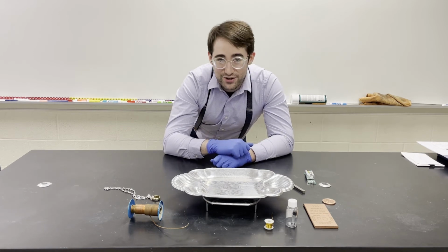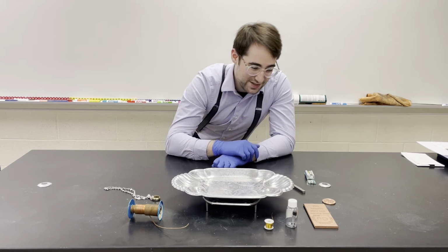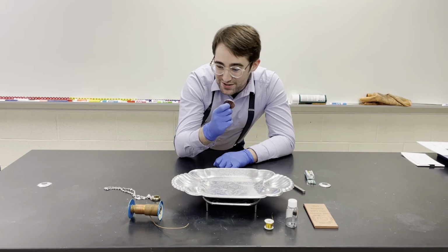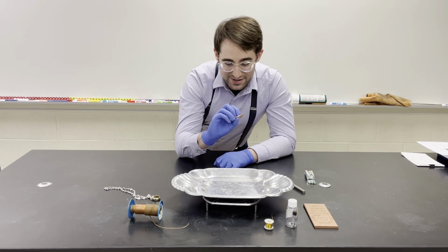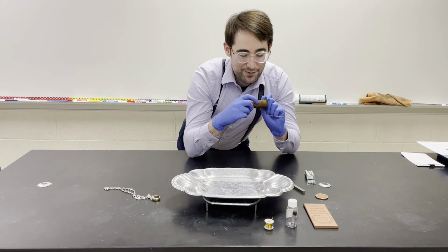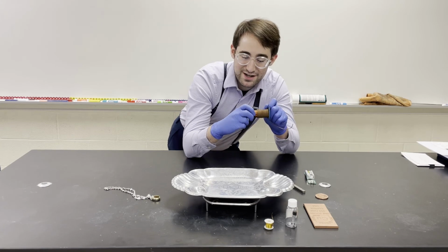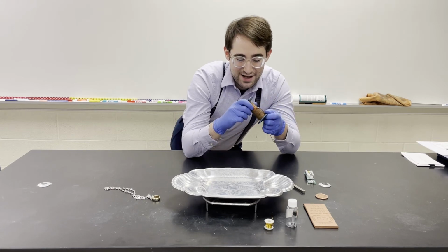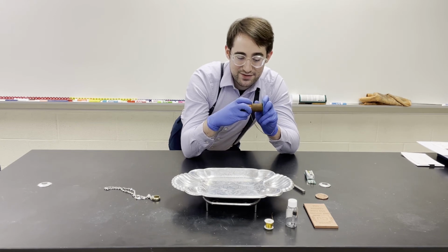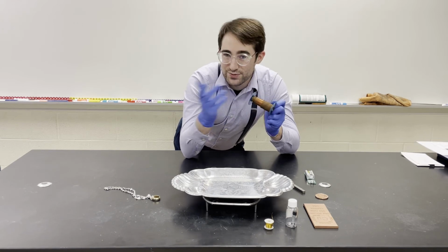All right. You can also look for oxidation, which kind of goes against the shininess of something. So when something looks shiny but has kind of a dullness to its surface, or it looks like there's some discoloration there, kind of like how you can see on this copper wire here, this older outside layer compared to this newer stuff that's been kind of covered and hidden away from the oxygen in the air. This oxidation can kind of coat it and cover it, and it's a new compound that has different properties than the metal itself.